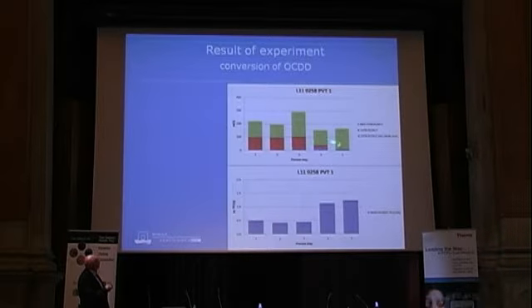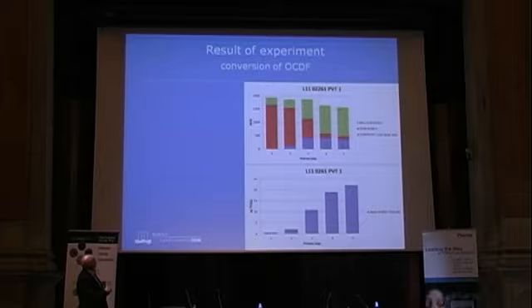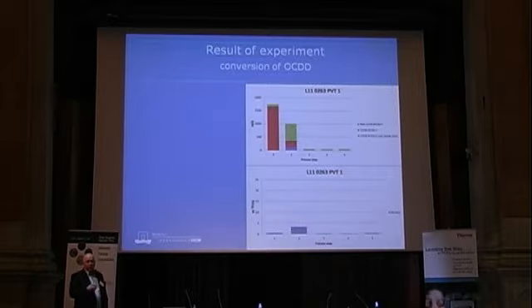Another example, even more strict, OCDF. We started with a sample containing 1500 picograms with a low TEQ level, and after hardening we ended up with 22 picogram TEQ per gram fat, so really a problem. Nowadays this company is capable of processing crude palm oil, hardening it with a high amount of OCDD, resulting in a very low level at the end. Okay, so they're making some improvements, and we will publish this work.